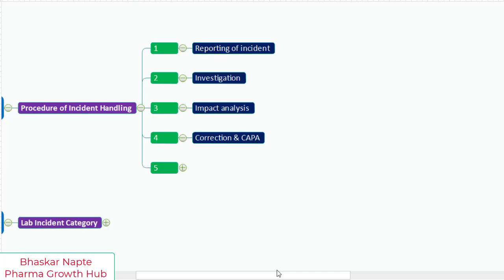What is preventive action? Preventive action is the action taken to eliminate the possible potential non-conformities. Now, the non-conformity is what? No peak was observed because of the usage of the wrong HPLC column. The wrong HPLC column usage can lead to no peak during the chromatographic run. But is that the only reason which can lead to no peak in the chromatogram? Now there are other reasons too.